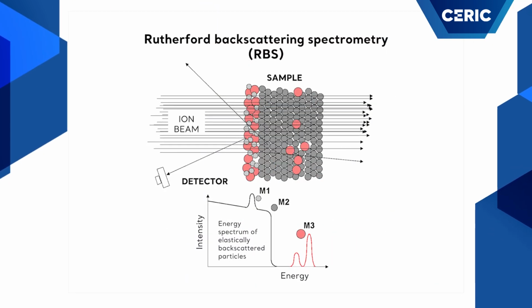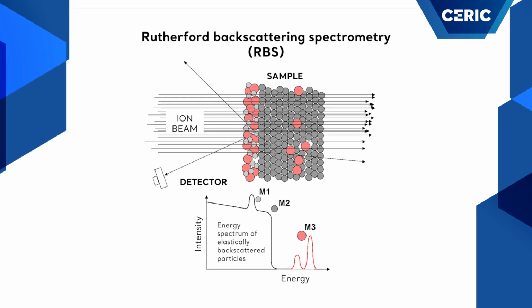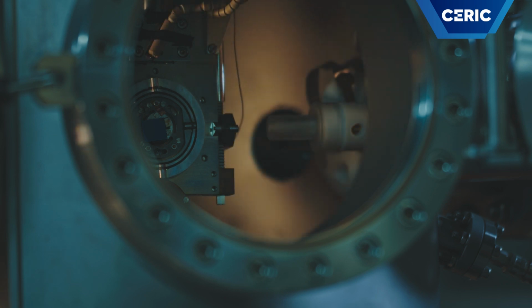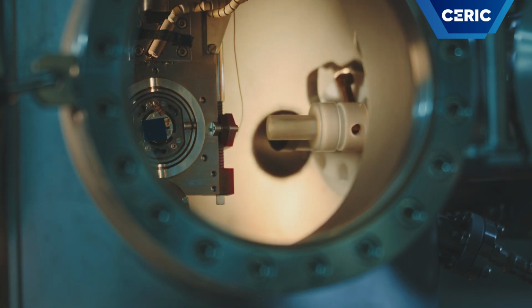This depth can be determined, allowing to profile the element concentration and composition close to the sample surface. The backscattered energy is measured by the silicon charged particle detector.